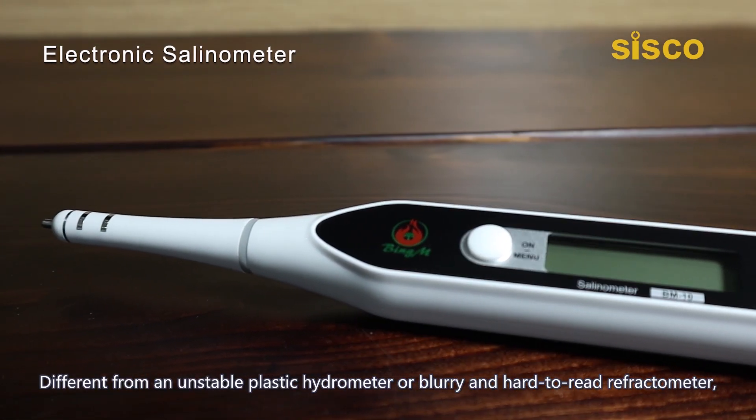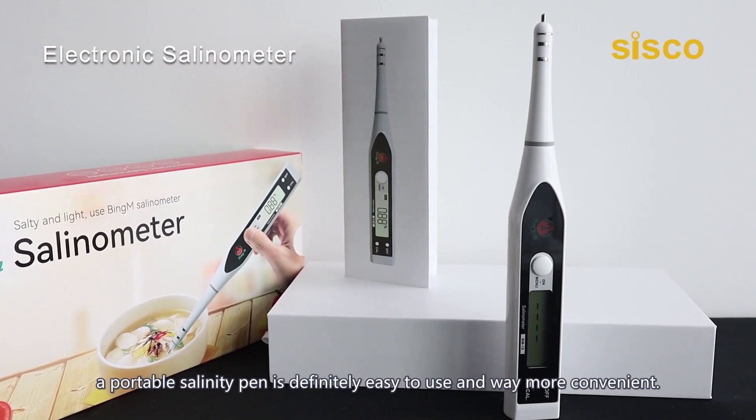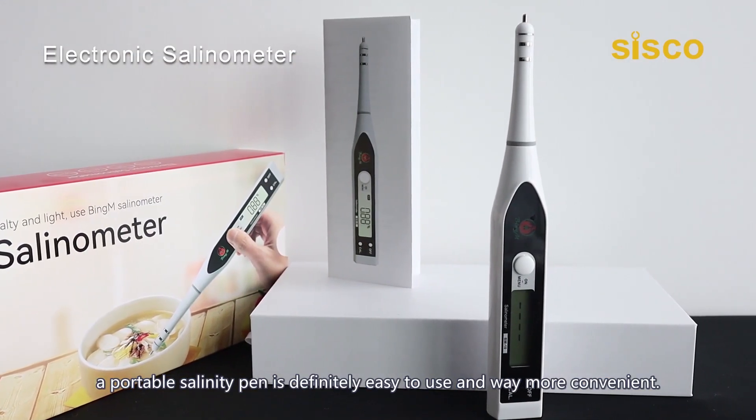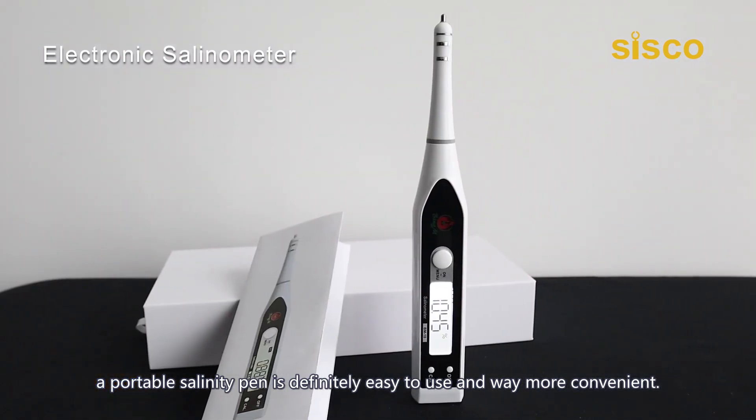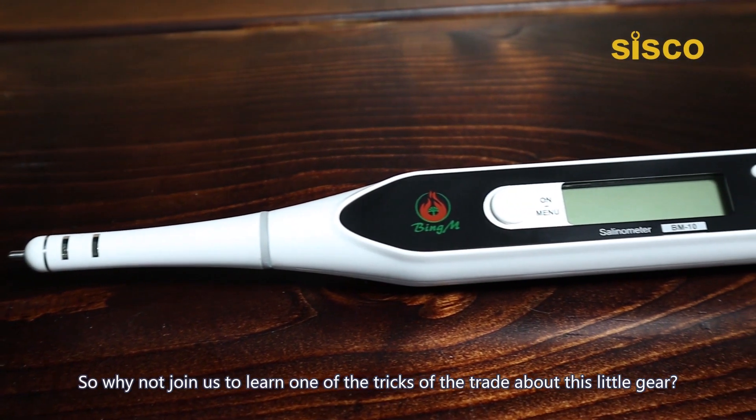Different from an unstable plastic hydrometer or blurry and hard-to-read refractometer, a portable salinity pen is definitely easy to use and way more convenient. So why not join us to learn one of the tricks of the trade about this little gear.